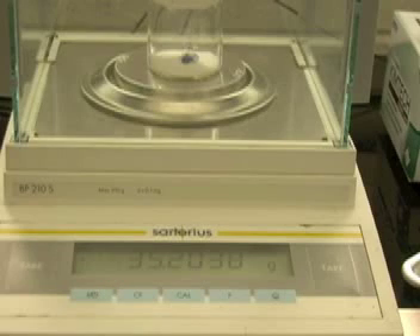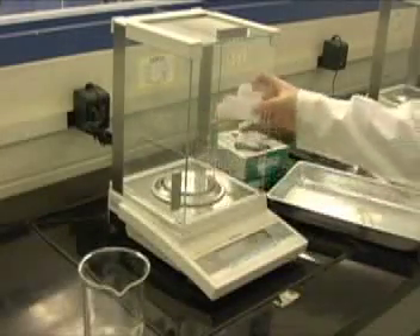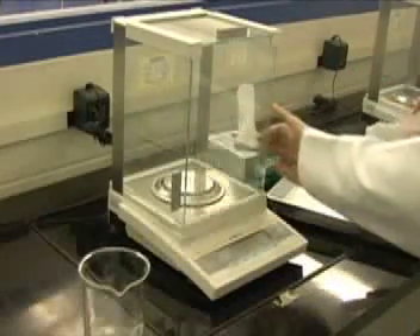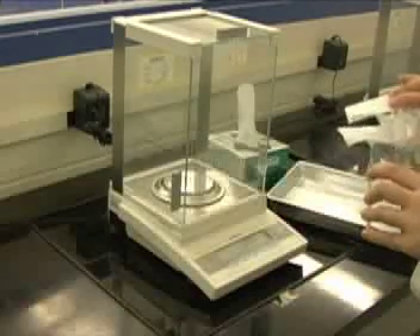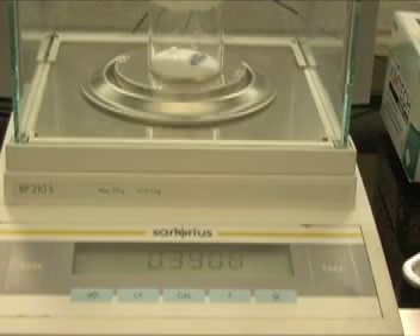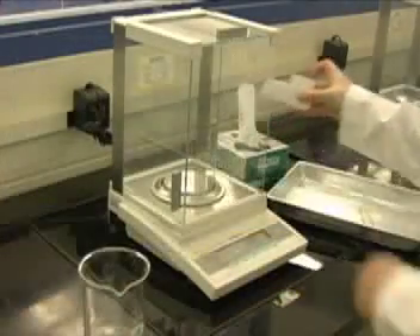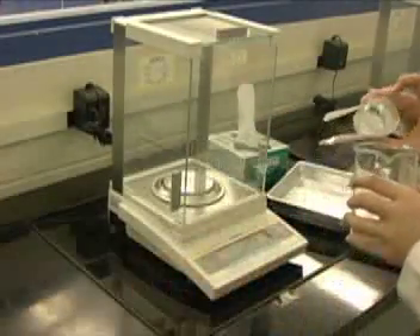If you must transfer a specific amount of your sample to a beaker, you must weigh by difference. Once the balance is stabilized, press tare. Remove your weighing bottle from the balance and transfer a small amount to the beaker. Return the weighing bottle to the balance. The negative number displayed indicates the amount that has been transferred to the beaker. Continue to add the sample from the weighing bottle to the beaker until you are satisfied with the amount transferred. Record this value.